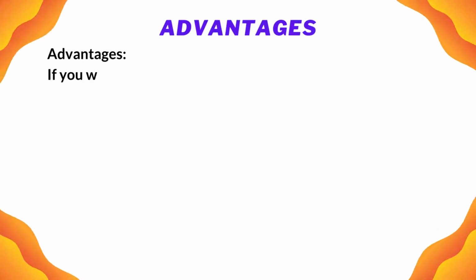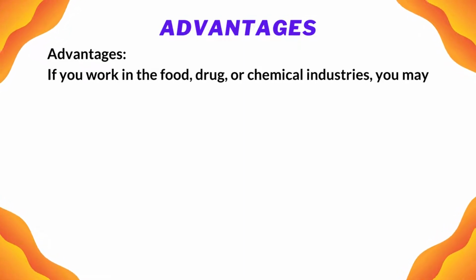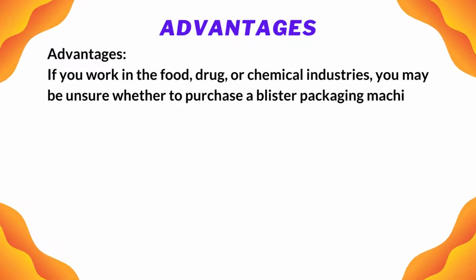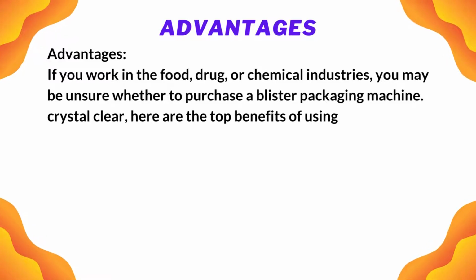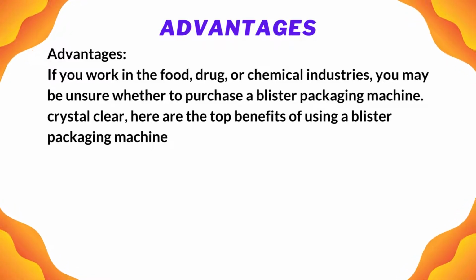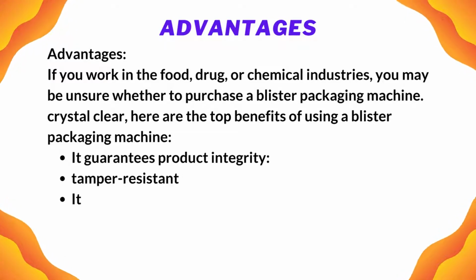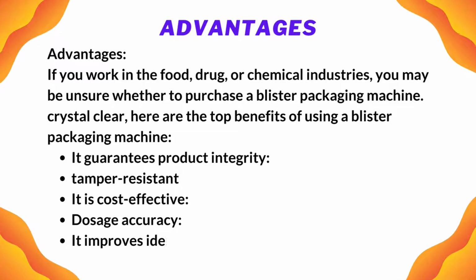Advantages. If you work in the food, drug, or chemical industries, you may be unsure whether to purchase a blister packaging machine. Crystal clear, here are the top benefits of using a blister packaging machine. It guarantees product integrity. Tamper resistant. It is cost-effective. Dosage accuracy. It improves identification.